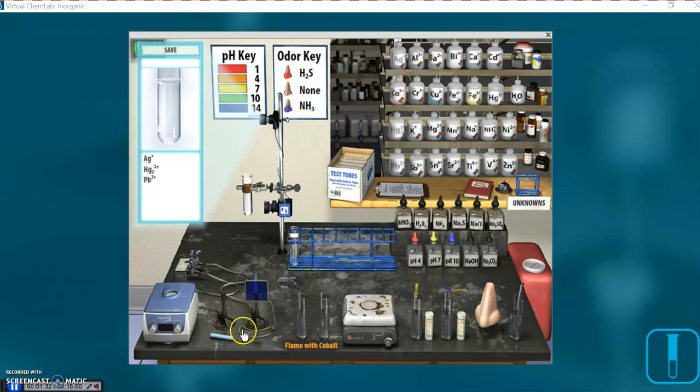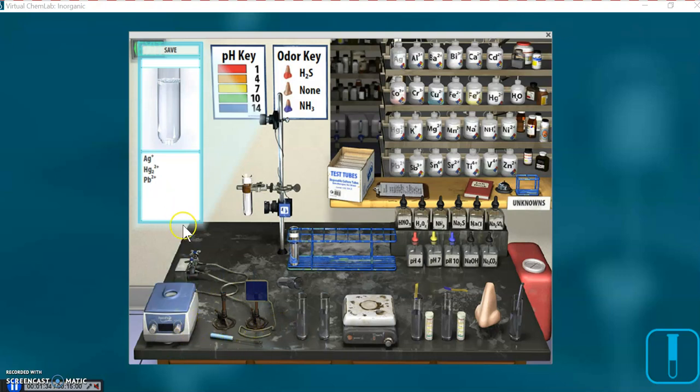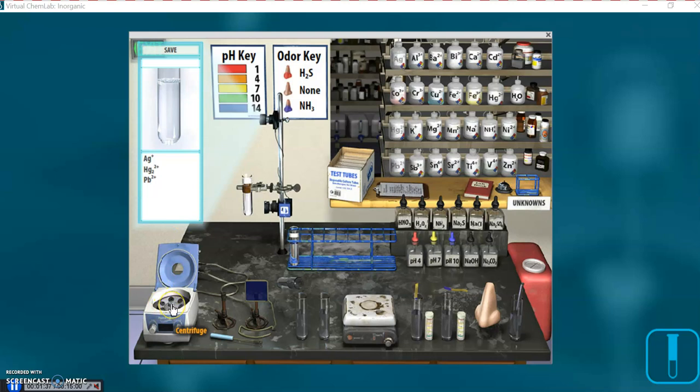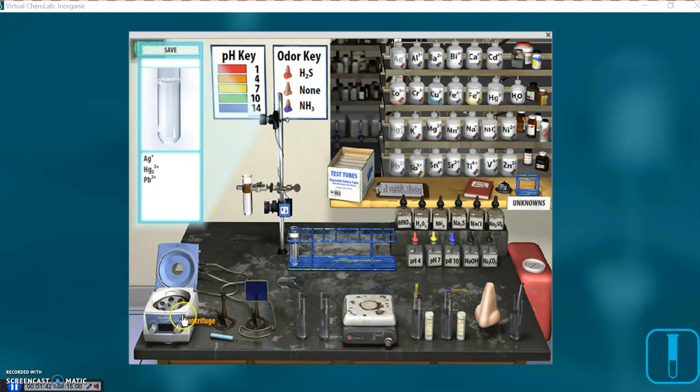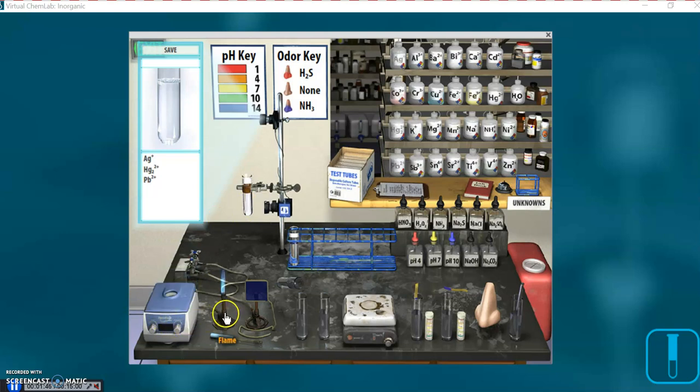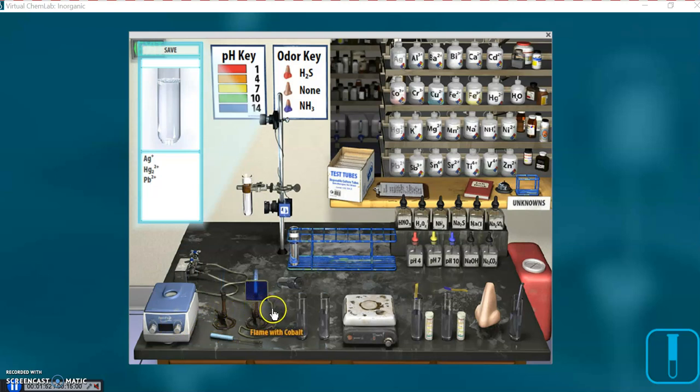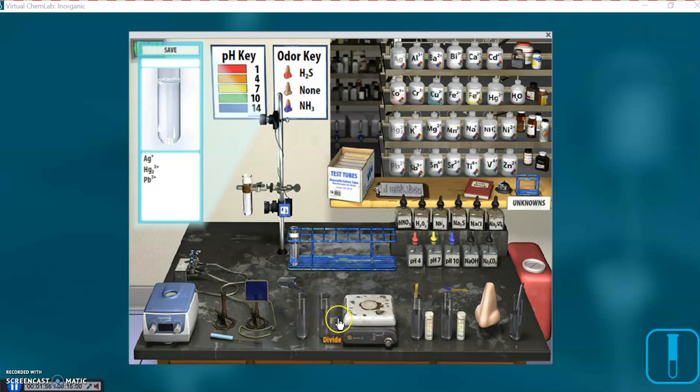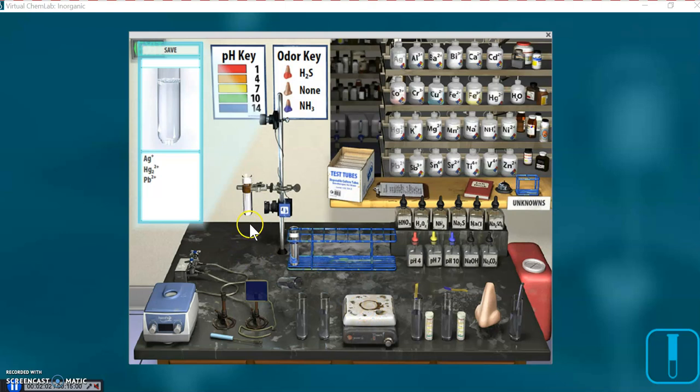If you haven't done one of these labs before, you might not know these functions and devices down here. There's a centrifuge, you just click on it, you don't have to drag the test tube over. Just click on it and it immediately spins the test tube. A flame, or flame test, flame test with cobalt glass in the way. This decants off the top if you have a precipitate at the bottom. We already did Divide.